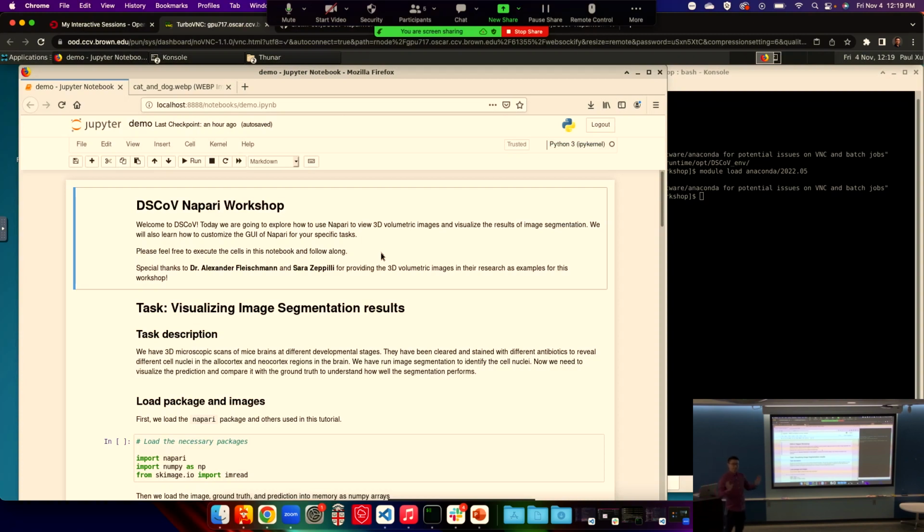In the meantime, if you have any questions about setting this up or about Napari in general, please feel free.